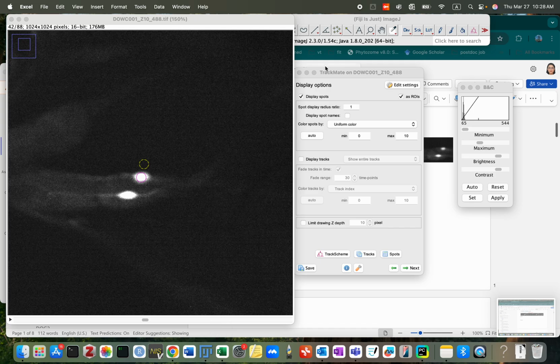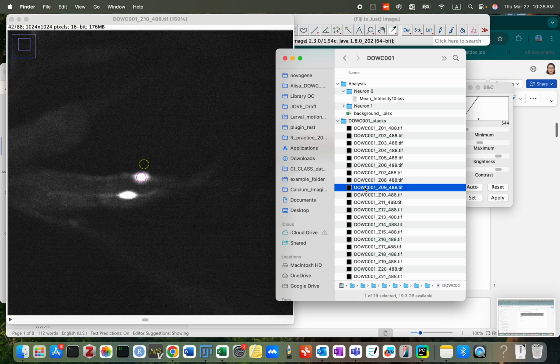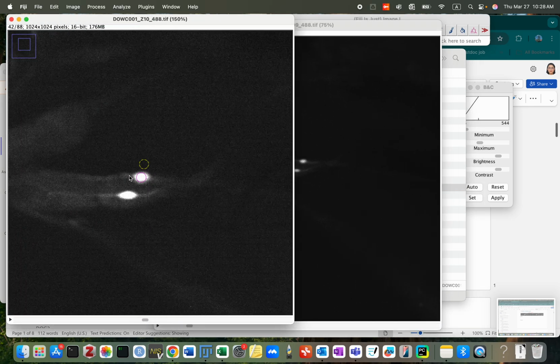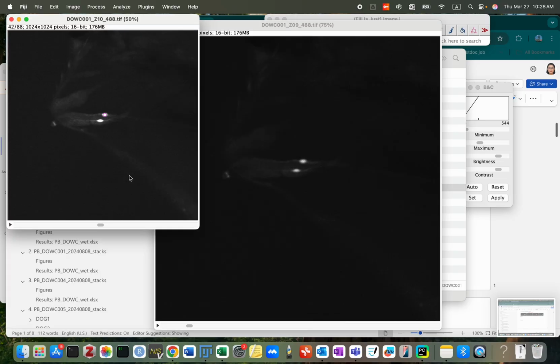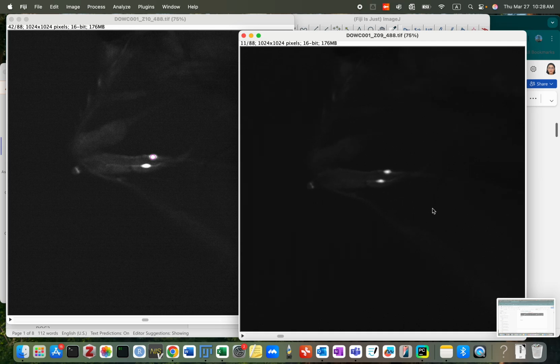So let's close this window, then we will check the neighboring stacks. We finished 0, 10, now let's see 0, 9. To have an idea how this stack is, let's go back to compare the same time points. So for example, like number 11, and this is come to 11. Okay, same time points. Yes, you see Z stack 9, the signal is getting weaker.